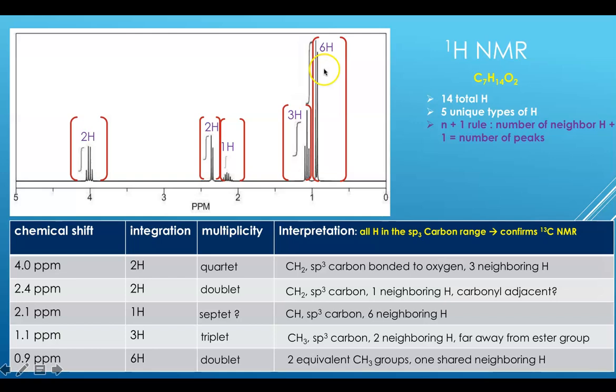All right. So one more thing that this data can tell us, because we have 1, 2, 3, 4, 5 peaks. But we have, and then this one is probably representing 2 carbons, and the other one's 1 carbon. So that's still only 6 carbons, but we have 7 in our molecule. So that tells us that that carbonyl, trigonal planar carbon is probably not bonded to any hydrogens. It's probably bonded to another oxygen, making it an ester, and a carbon on the other side. So that's going to become more clear when we summarize all of this data, but just wanted to point that out.